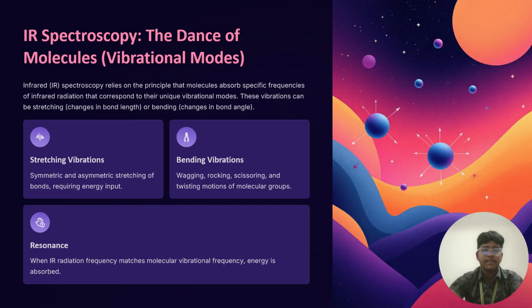Stretching vibrations. Symmetric and asymmetric stretching of bonds requiring energy input. Bending vibrations. Wagging, rocking, scissoring, and twisting motions of molecular groups. Resonance. When the radiation frequency matches the molecular vibrational frequency, energy is absorbed.